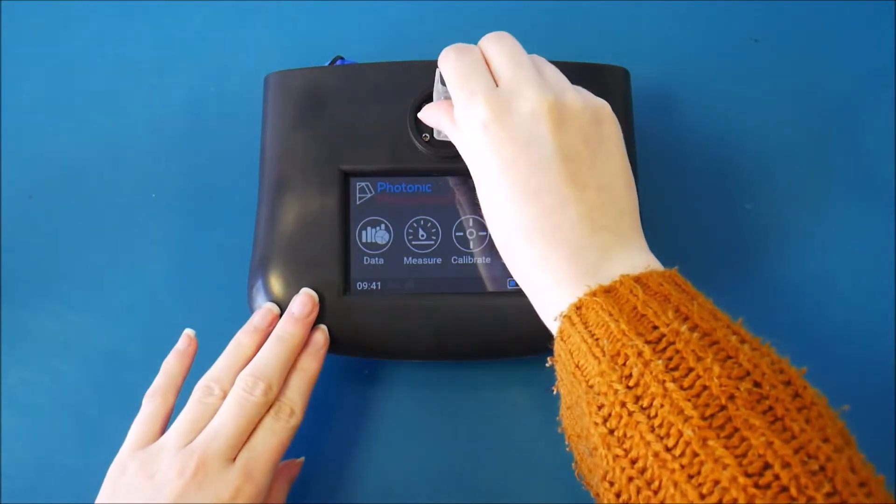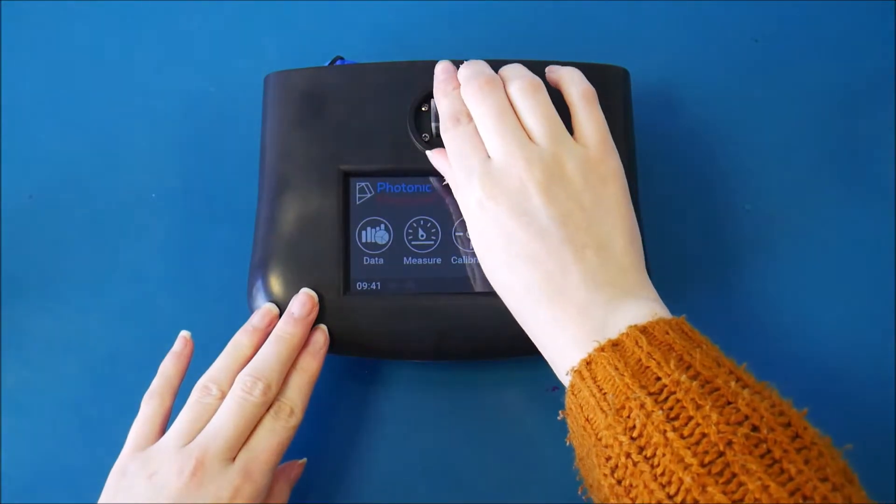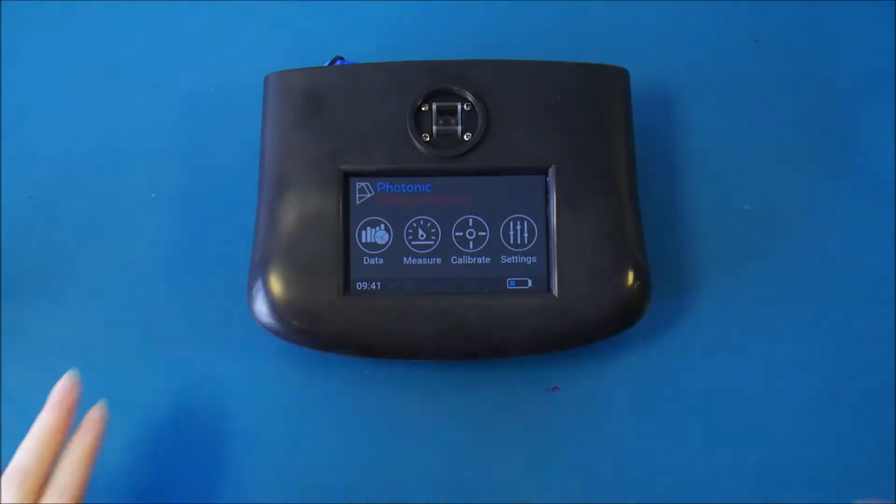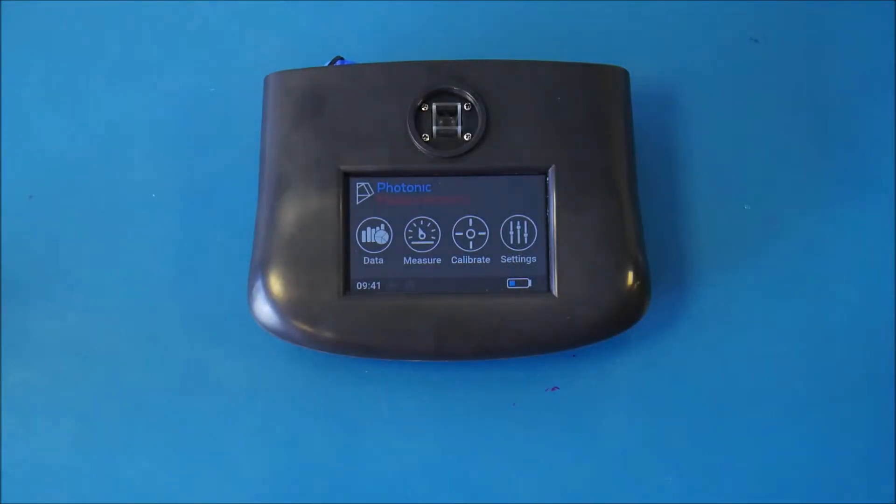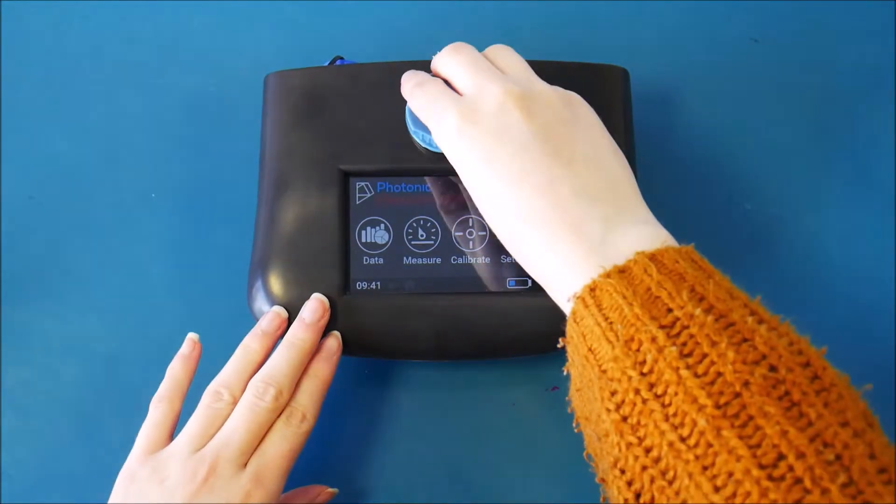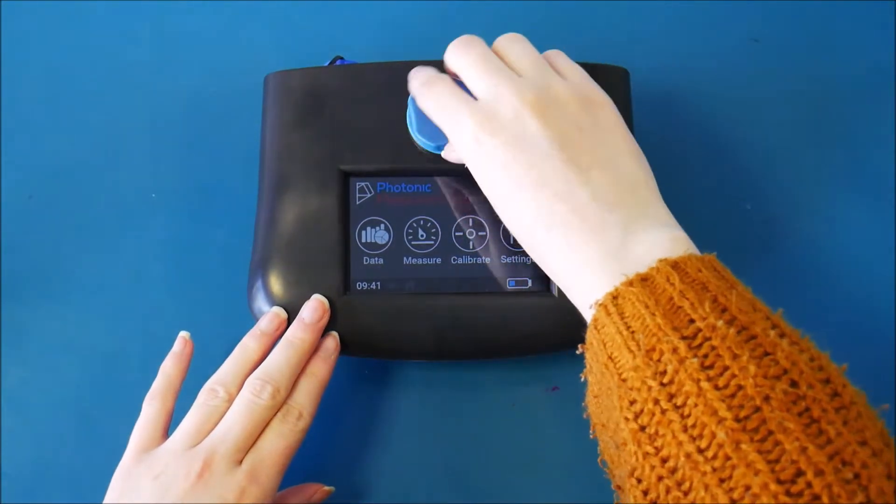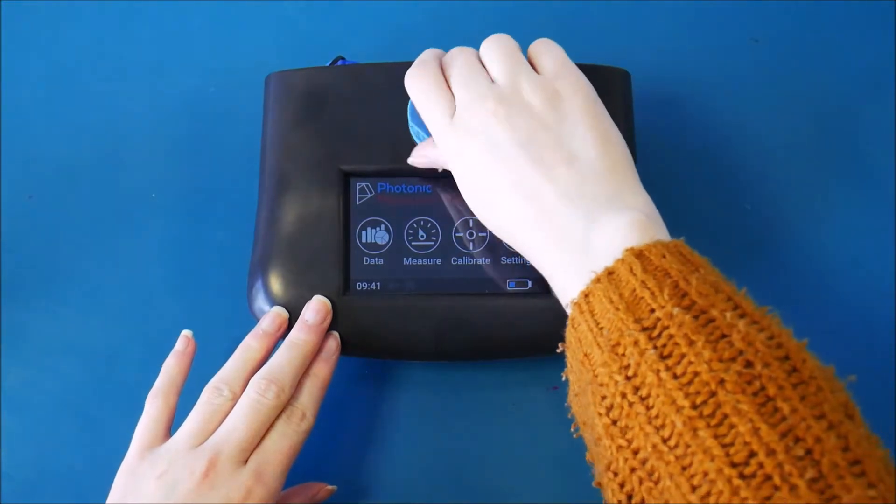Then place into the GO, ensuring clear sides are facing the light path. Place cap back on and press to measure. It's that simple.